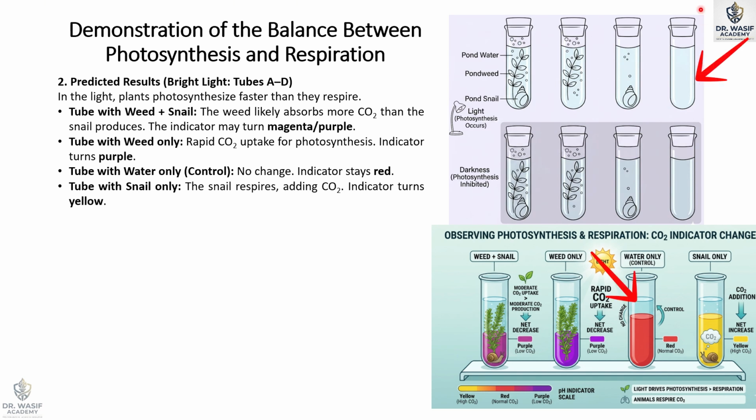So this is the control. There is no pond snail, there is no pondweed, there is no life. If there is no life, it means there is no change. It will stay red.